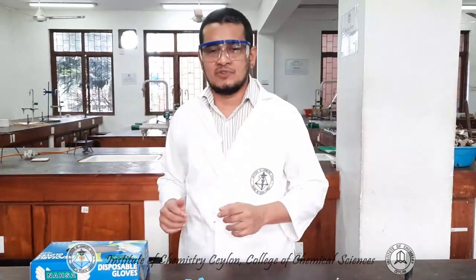And when you are washing your lab coats, do not wash lab coats with other clothes. And if your mother or father is doing that job for you, specifically instruct them not to wash your lab coat with other clothes, especially if you are using a washing machine.